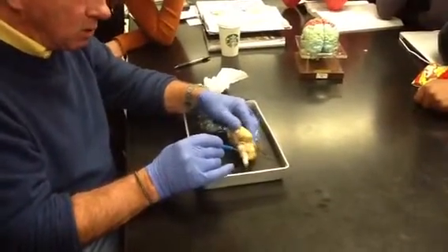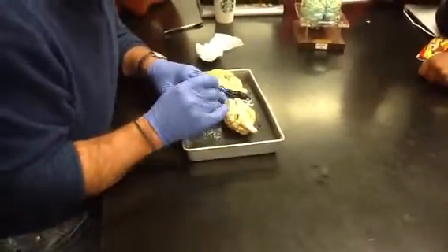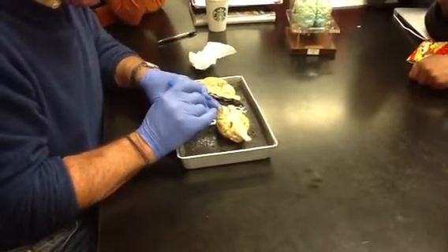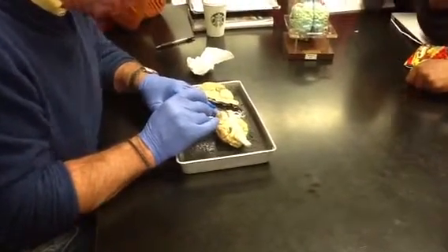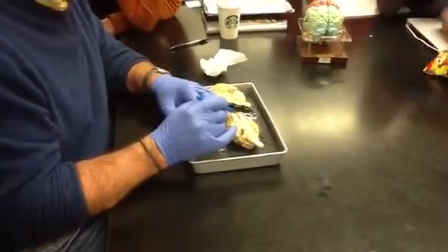And if we turn it over, you can see here at the front of the brain, there's some whitish tissue right here and a little bit more right over here. That's the olfactory bulb. That's the smelling apparatus for the sheep.